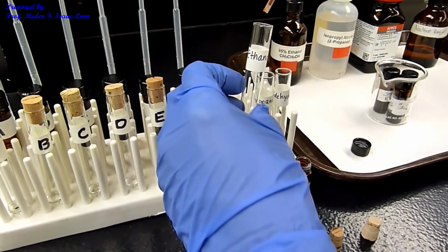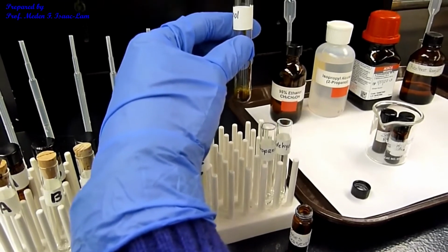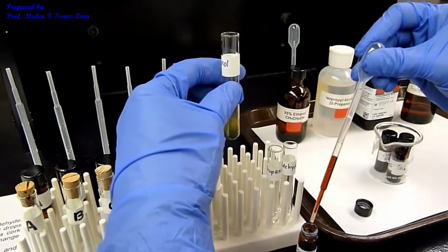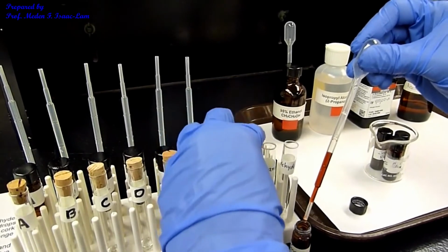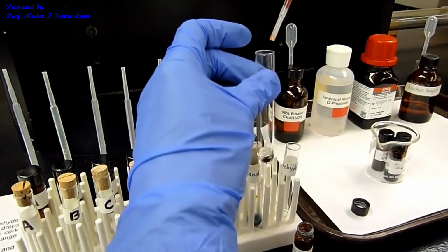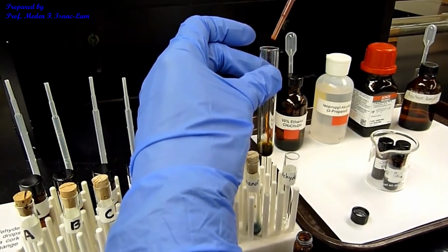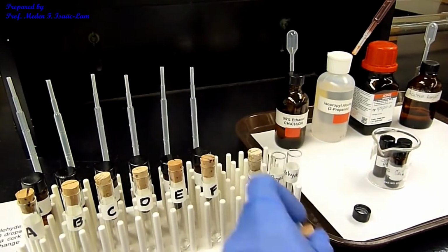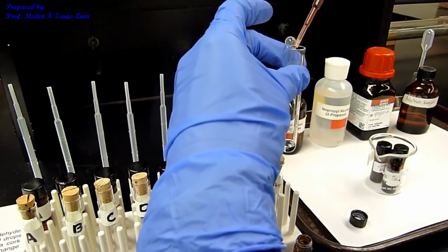So 2 drops. So you heard that pop. It's quite reactive. And then I'm going to put the cork. And then, okay, cork. And then finally the aldehyde.